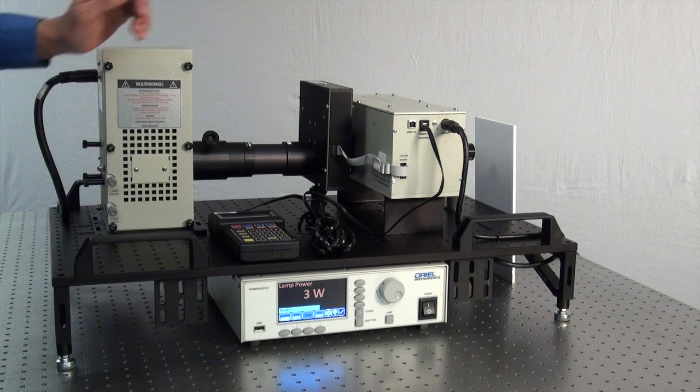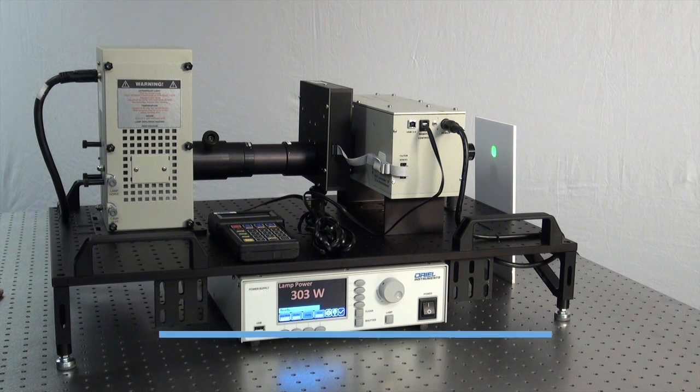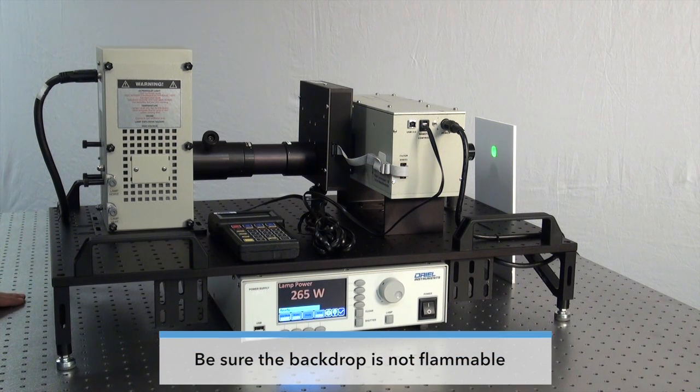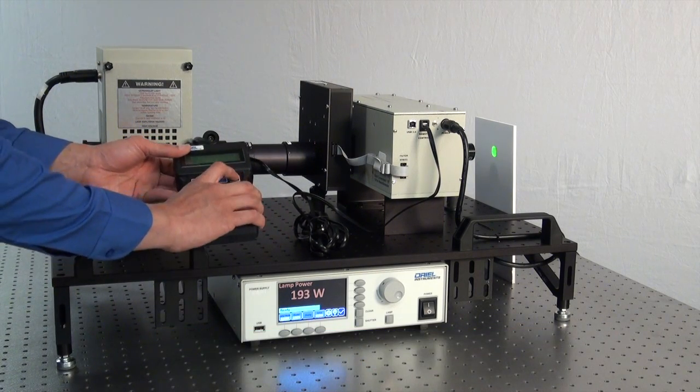It also helps to have a white or black sheet of paper to serve as a backdrop a few inches away from the light source so you can see the output of the light source. And it helps to set your monochromator to zero to keep a white light output.